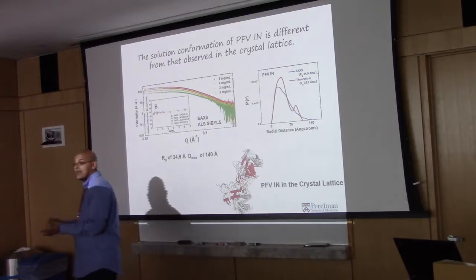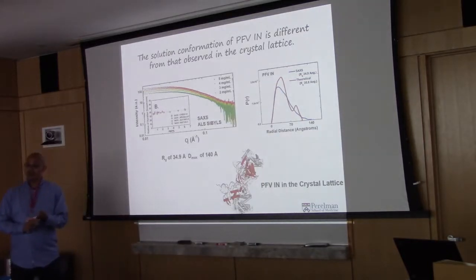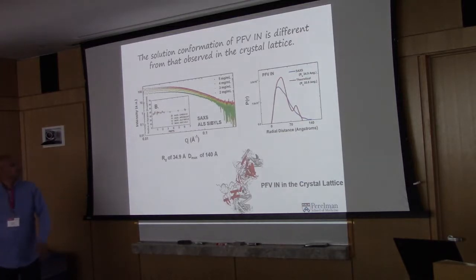Took it to APS. I also did neutron scattering at NIST, right? I was really kind of curious: if I had the same protein, how consistent would it be between different sources? And the answer is it was extremely consistent, with best practices. I can get the same experimental result profile at many different locations for the same protein. And across a range of concentrations, this thing is exclusively monomeric. This was a question in the literature, that some people were observing dimers based on a little tailed peak on gel filtration. This thing is monomeric by 3 different measures, at least in our hands.